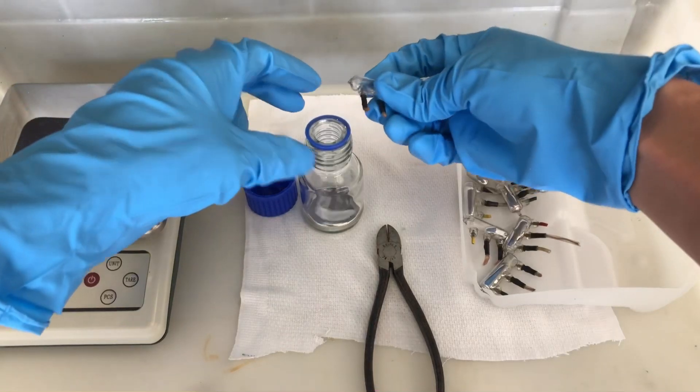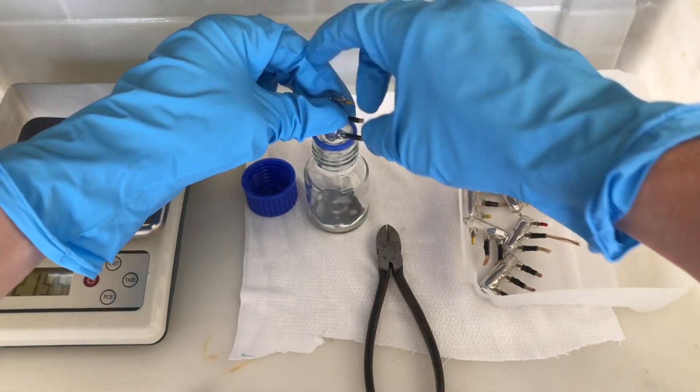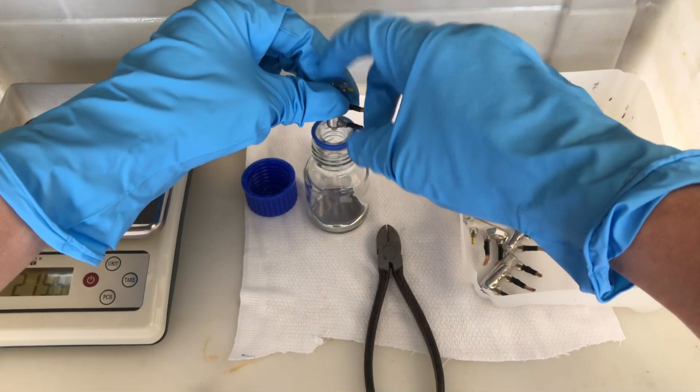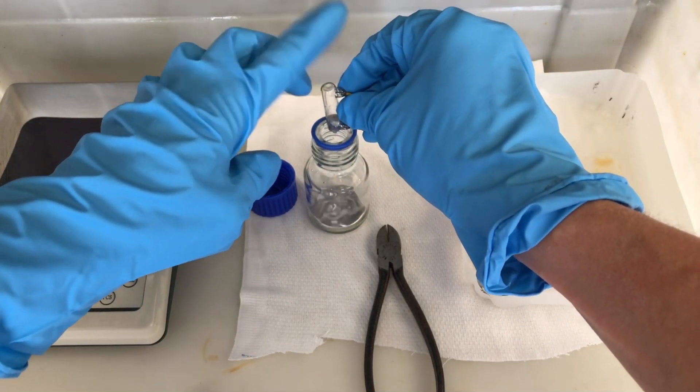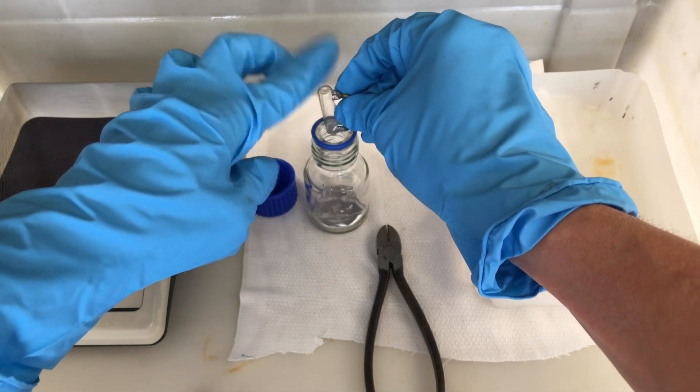Transferring it to the bottle is easy. You just have to tilt the mercury switch and tap it lightly. Mercury is extremely heavy, about 13.5 grams per milliliter, and therefore it will come right out if you just tap the ampule.